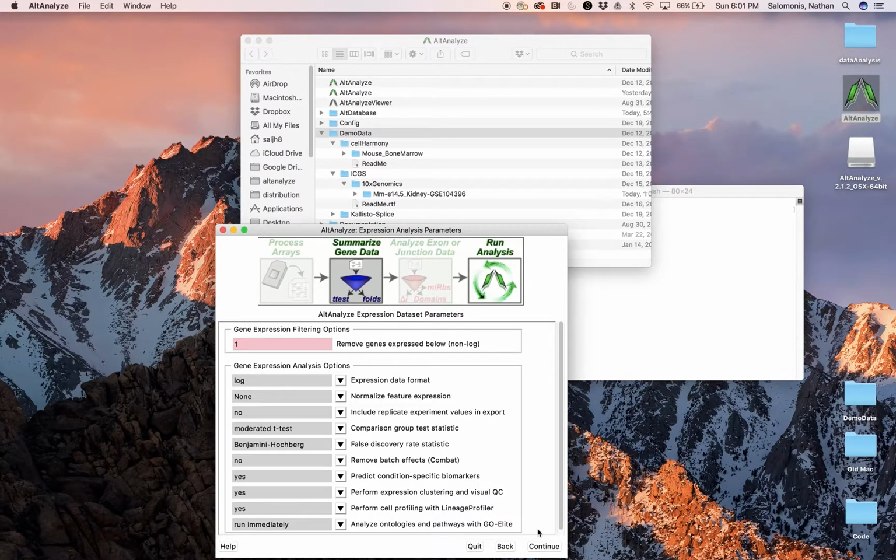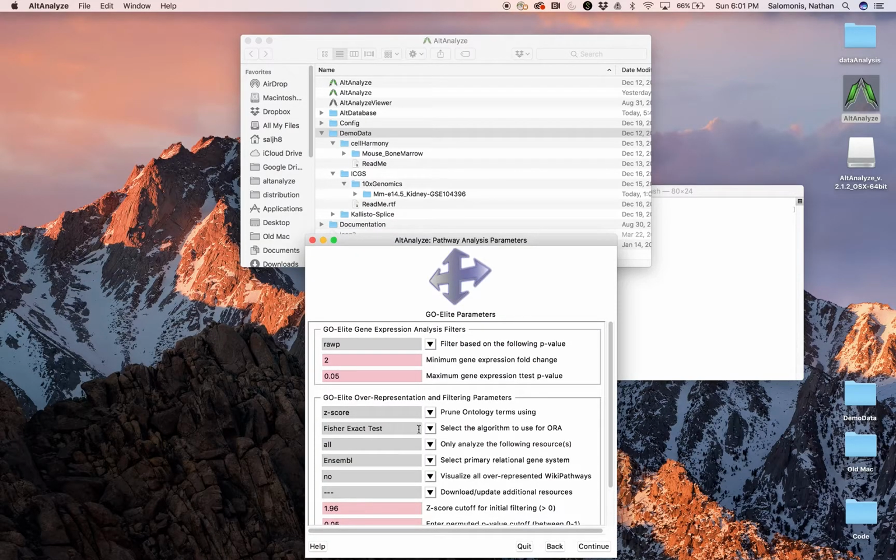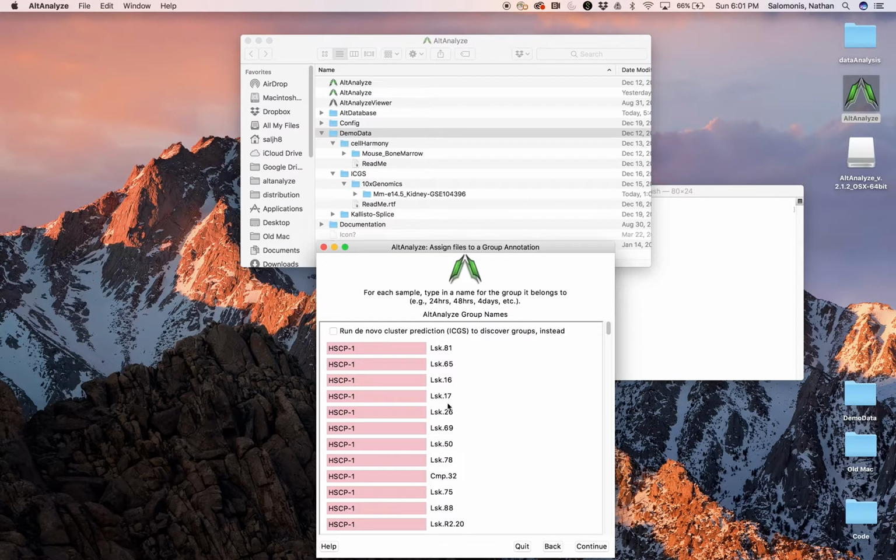You can modify these later. These include statistical thresholds, options for pathway analysis and pathway visualization, and a lot of other neat comparisons that you can perform. Normally, this is empty here, these fields where it shows different groups. If you want to perform a differential comparison analysis between known populations, you need to populate these in advance manually or through an external text file with a specific format.